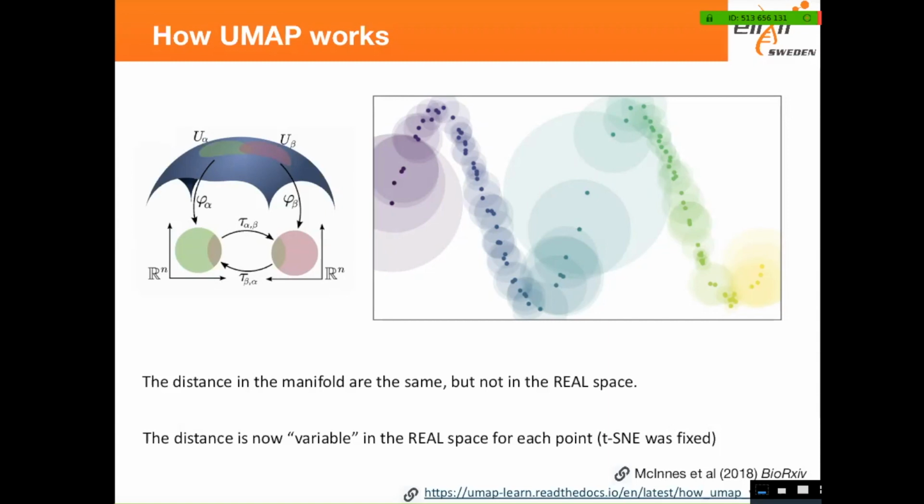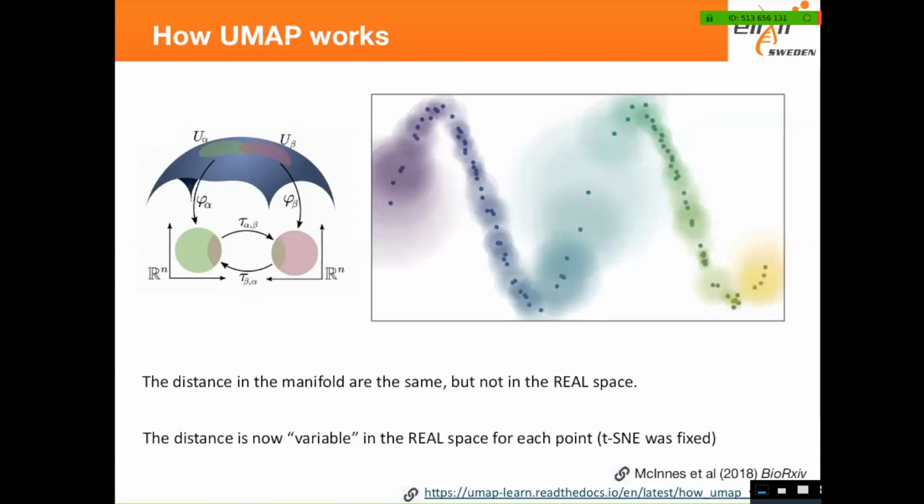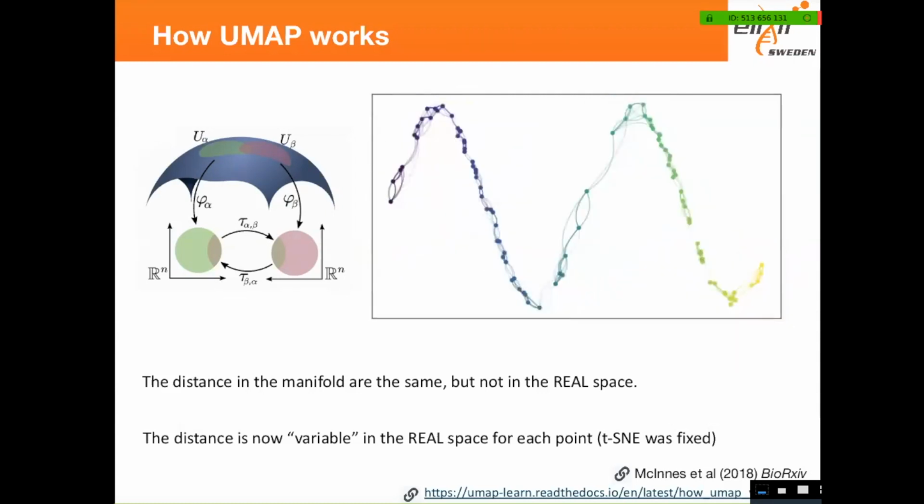It's quite complicated, I'd say as well. But then you also can have, just like the tSNE, a fuzzy representation of your graph. So you don't really consider all the furthest apart, but at least to some degree. And then you can do that several times, and then now you connect the whole data set. So that's how UMAP would get the sense of the global structure of the data and also the local embedding.